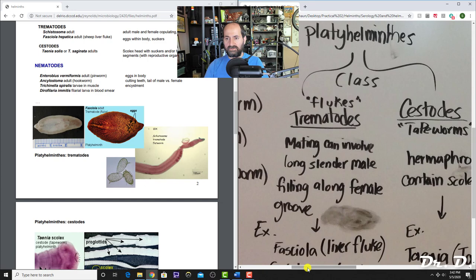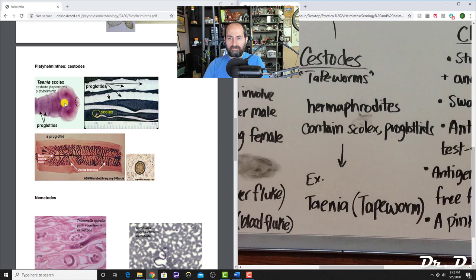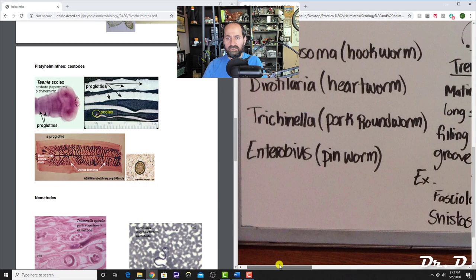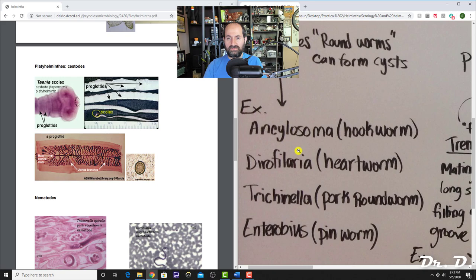For the cestodes—tapeworms—you need to know the body parts: the sucker, the head called the scolex, and the body segments called proglottids. You should know those terms: scolex, proglottids, sucker. Tapeworms are hermaphroditic, meaning they have both male and female parts. The example here is Taenia, the typical tapeworm.